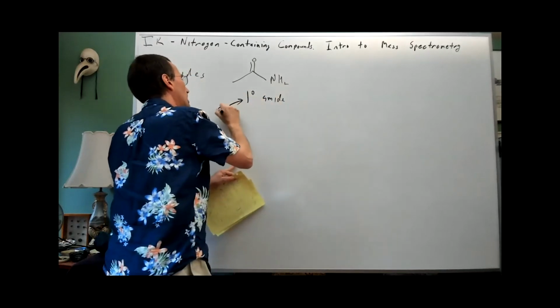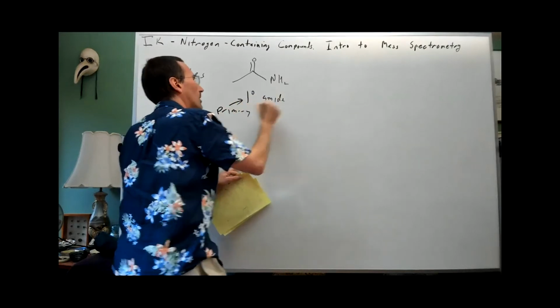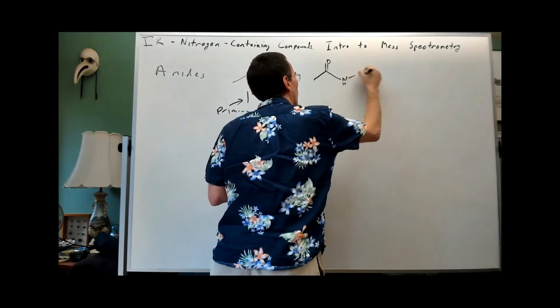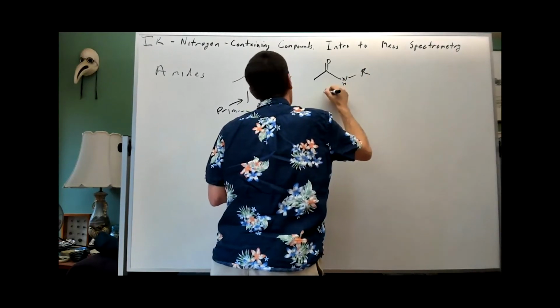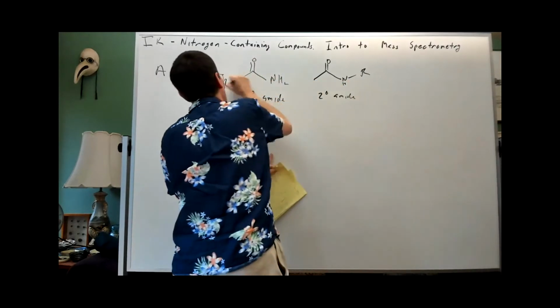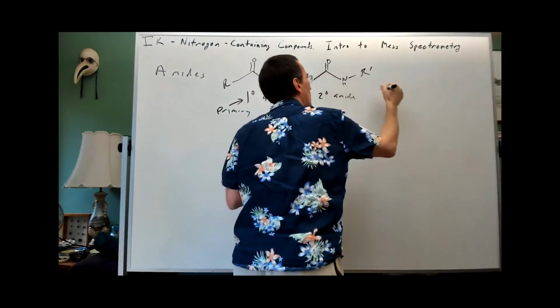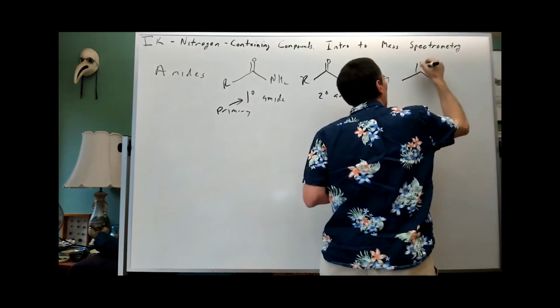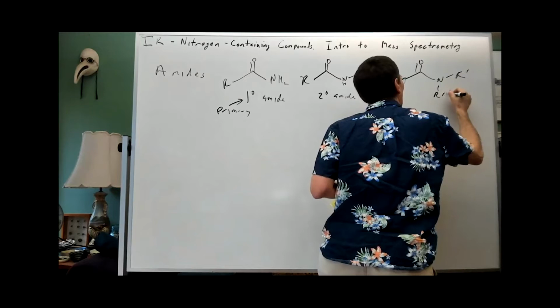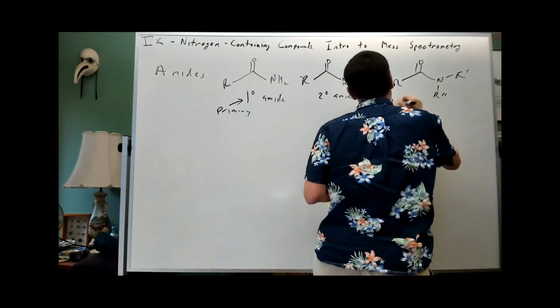That's primary. That would be a secondary amide. We'll just say R prime. Tertiary amide.